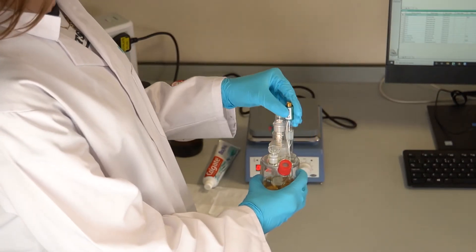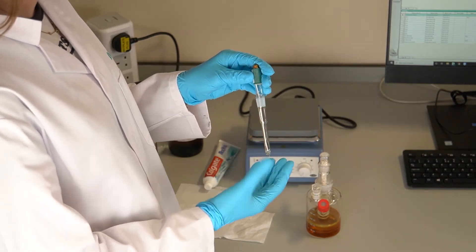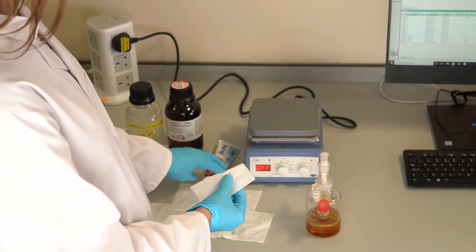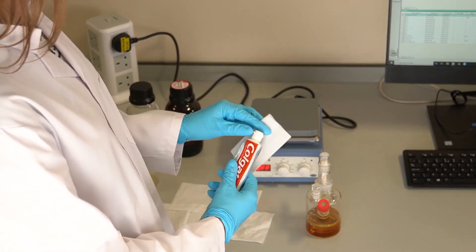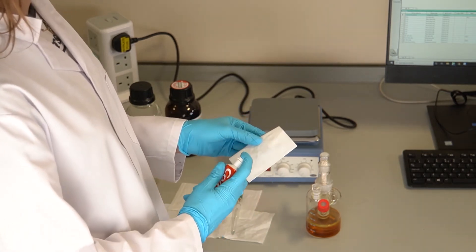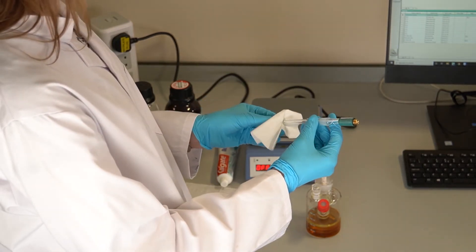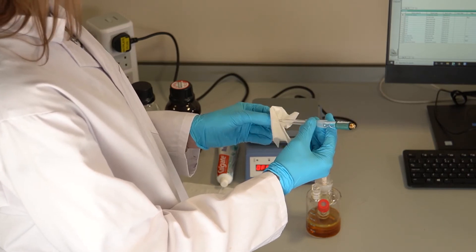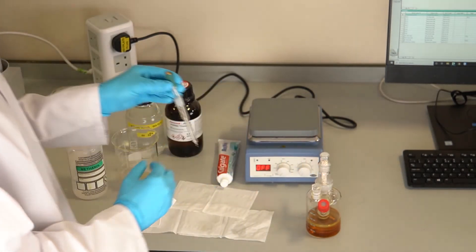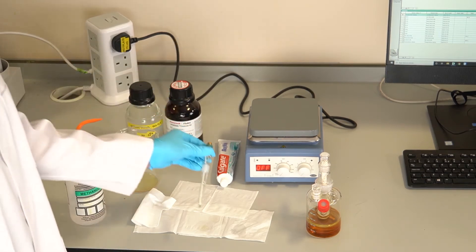Check the pins of the indicator electrode to ensure they are straight and parallel. Should the pins be bent, they can be gently manipulated back into place. Clean the indicator electrode with a small amount of toothpaste to remove any contaminants, then rinse with methanol.